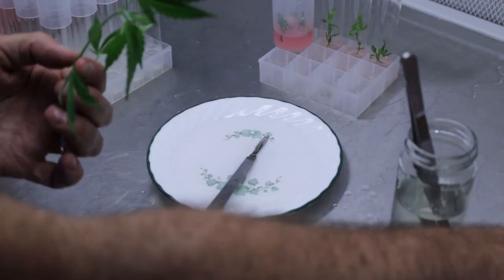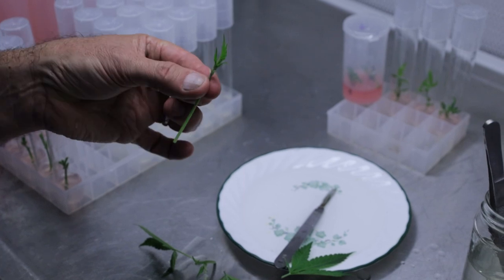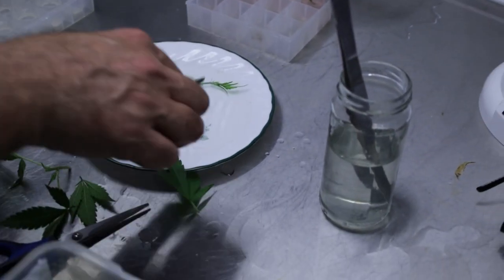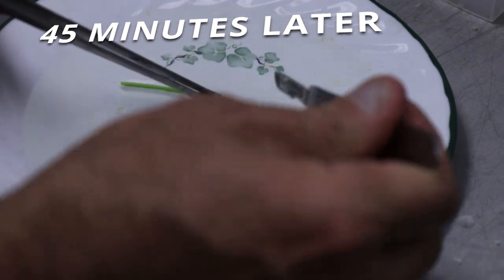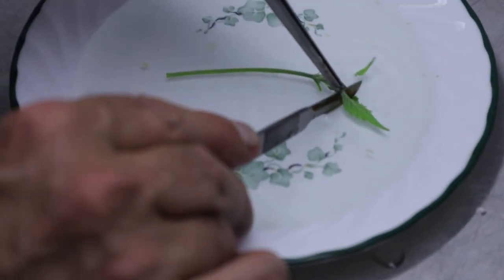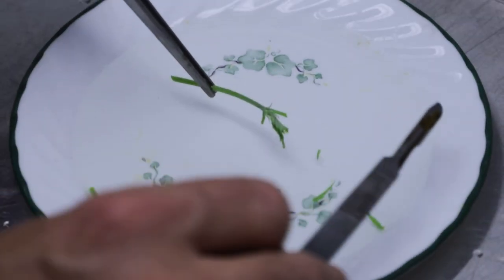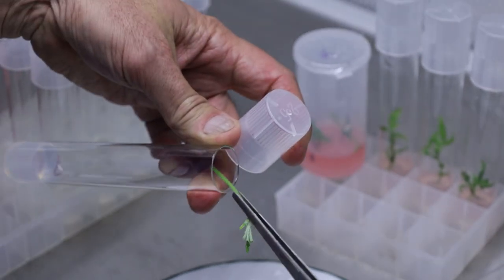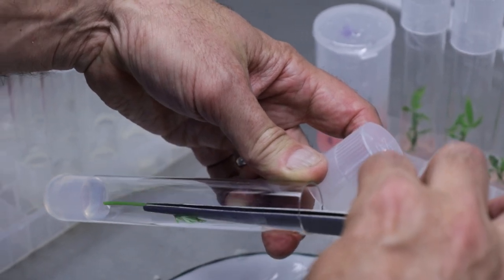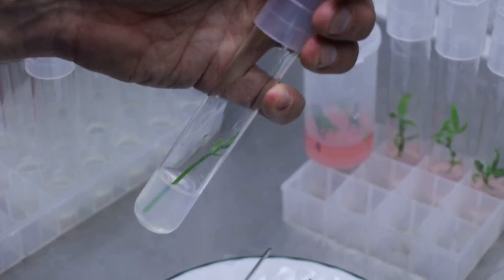The box is a still-air hood to protect the plants. I'll start with this little plant — take off that, put it in the cleaner. I'll take that and cut off the leaves, trim off the tip, and then one last little cut — that 45-degree angle everyone's looking for. There's your little plant. I'm going to take the forceps from back near the hinge and guide it down into the gel. Perfect.